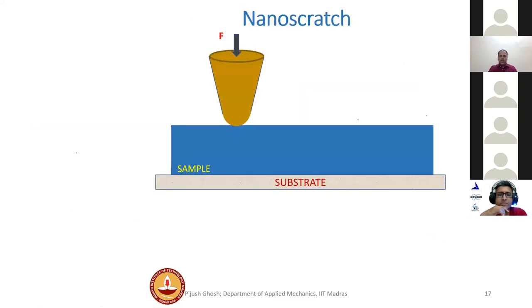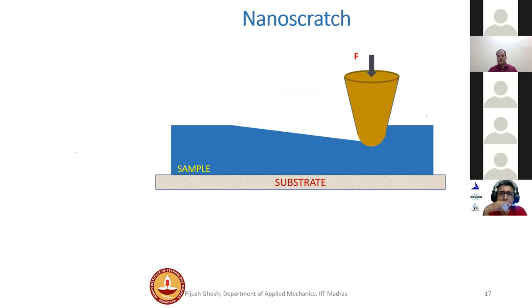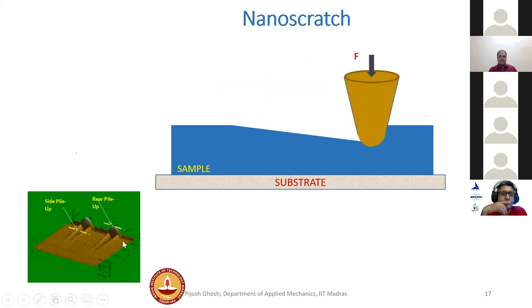Right? And I will not go into the details, but this is another thing which is very often used with nanoindentation. In this case, instead of a vertical load, you are applying a horizontal load like this, which is called scratch. And this is the typical post-scratch imaging, where you can see the pileup on the left and right and the rear end, depending on the material. This is from a polymer, that's why you are seeing so much pileup.